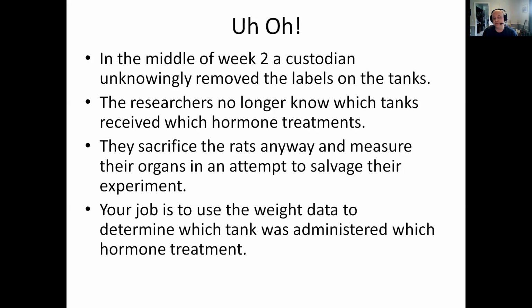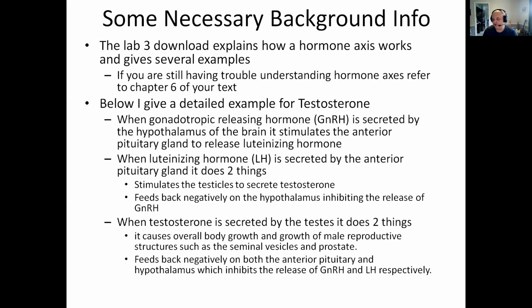And the whole goal of this lab is for you to use your understanding of hormone axes and some basic math skills to try to figure out which tank got which hormone, okay? That's the goal. All right. So how do we go about doing that? Well, first we got to understand how hormone axes work.